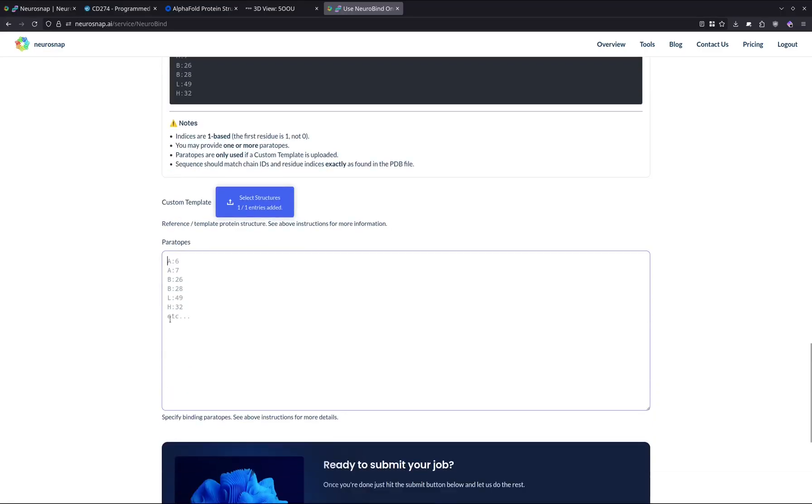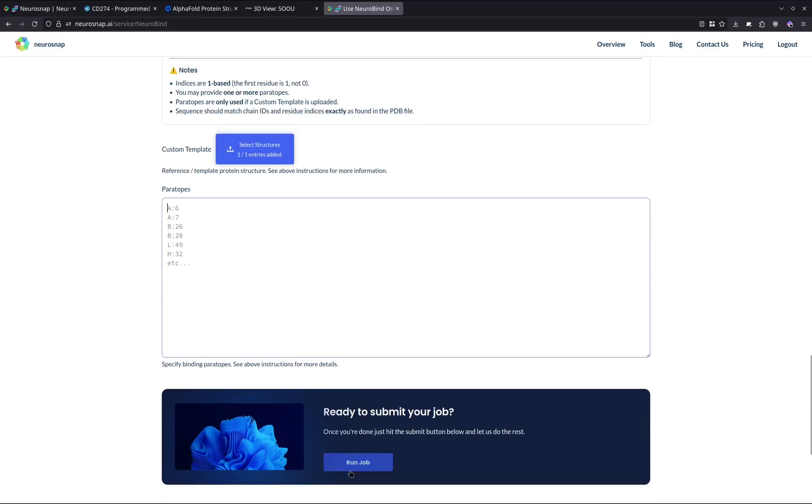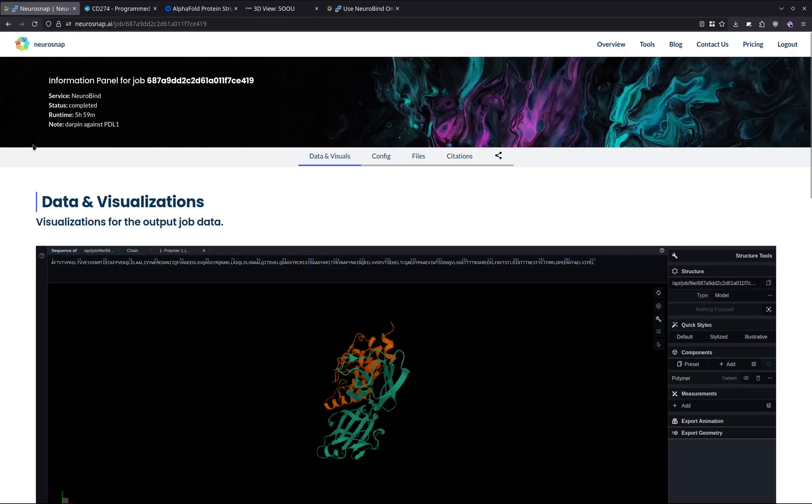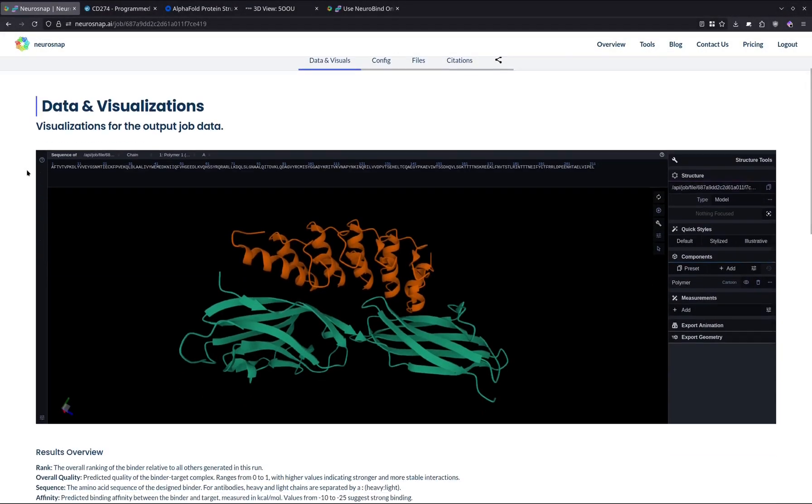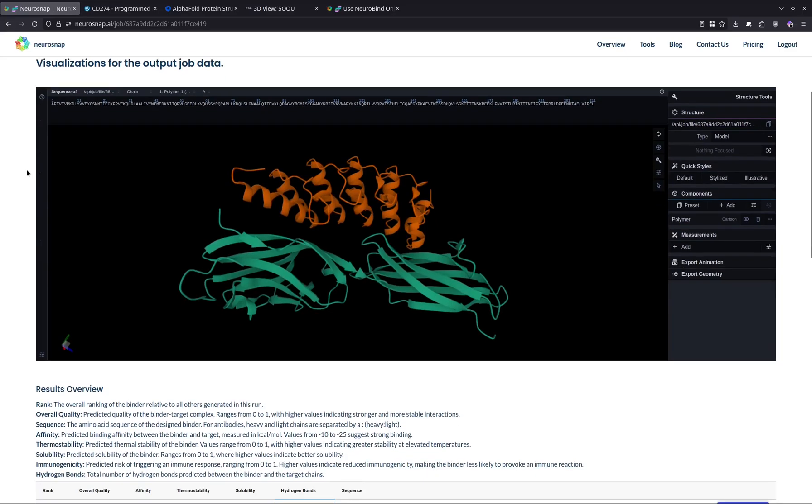So now what we're going to do is normally we just hit the run job button and we'd let everything run on the platform. But in our case, I've actually ran the model ahead of time, and we're just going to go through the results right away since the model takes a little bit longer than some of the other tools that we have available.